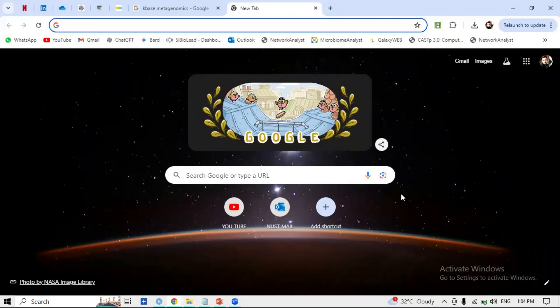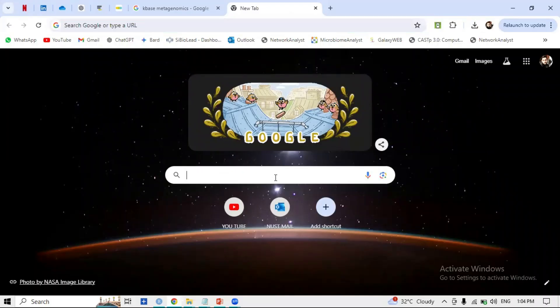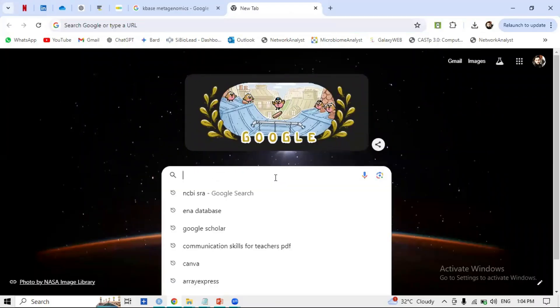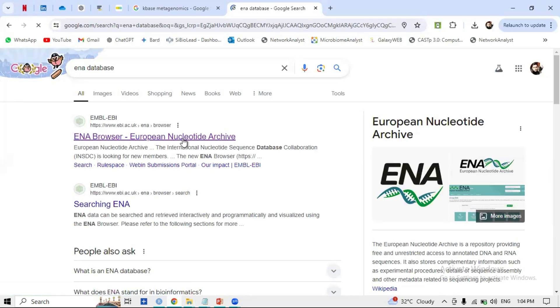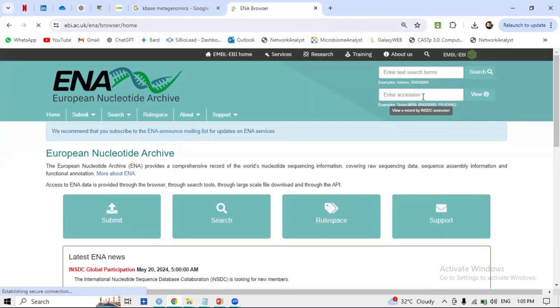Go to Google and search for the ENA database — that's the European Nucleotide Archive. Click on it and a home page will appear. On this page there are two search bars: one for entering text search terms and one for an accession number.